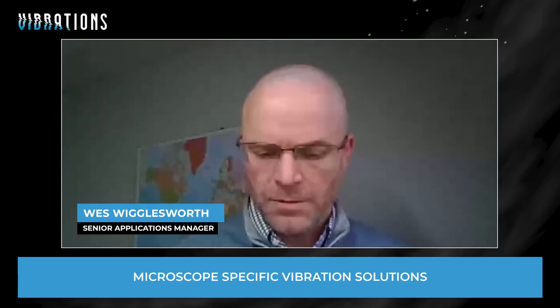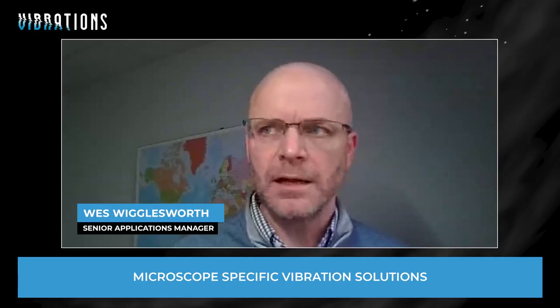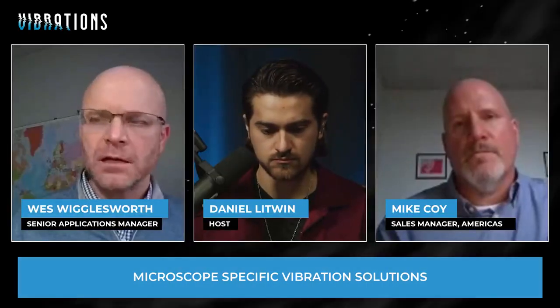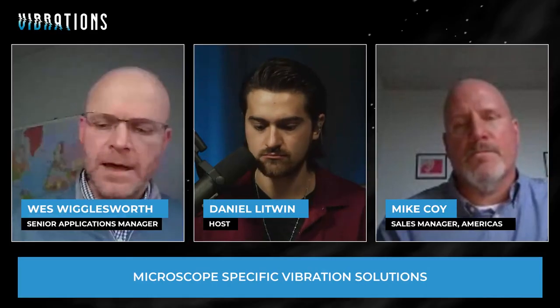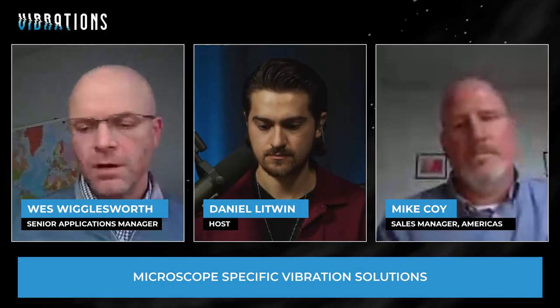So many have done maybe deeper analysis or characteristic of their frame. But I just wanted to address that we are often looking at vibration data from a facility, from an environment, and comparing that to a custom spec, or the VC curves.